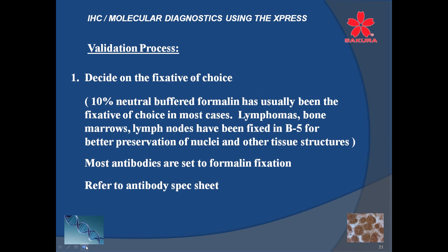So if we go through the validation process itself, you may want to decide on the fixative of choice. And I put in here that 10% neutral buffered formalin has usually been the fixative of choice in most cases. However, the special things like lymphomas, bone marrows, lymph nodes, in some cases prostates, have been fixed in B5, and we all know why, because of the better preservation of nuclear detail and other tissue elements.